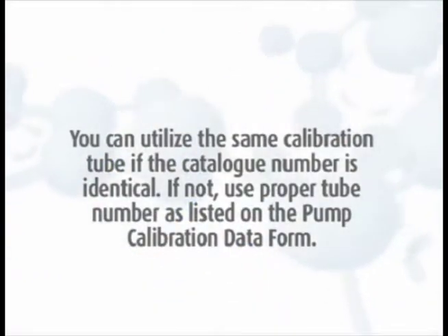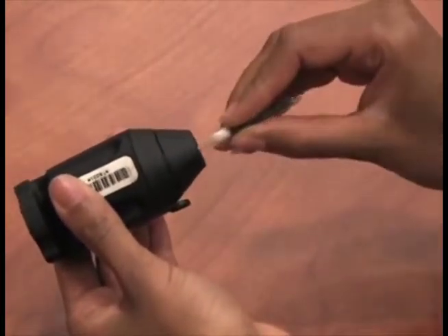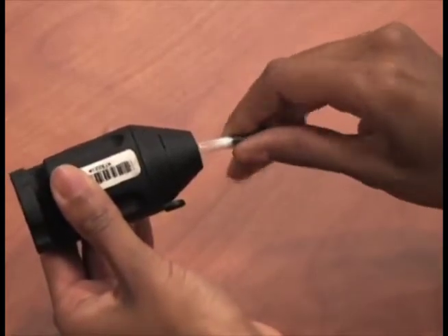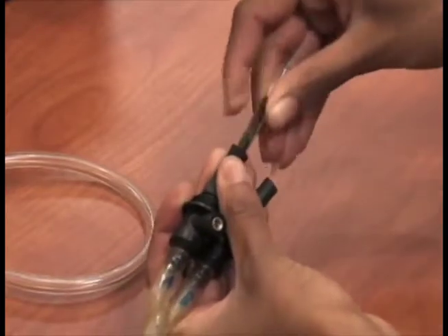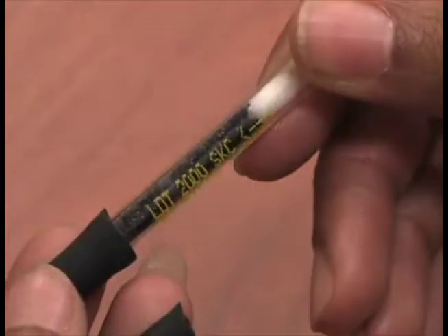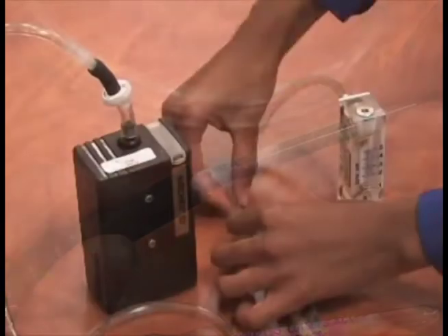You can utilize the same calibration tube if the catalog number is identical; if not, use the proper tube number as listed on the pump calibration data form. Use a tube breaker to break both ends of the tube to provide an opening at least one-half the internal diameter. Insert the open sorbent tube into the first holder's rubber sleeve marked A, with the arrow on the tube pointed toward the holder. If the tube does not have an arrow, place the end of the sorbent tube with the smallest sorbent section or backup section into the tube holder toward the pump.